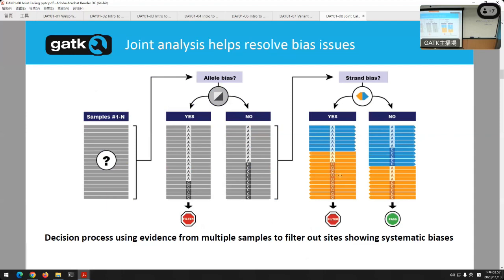You look at that and say, regardless of the number, I can see that now. I can say if they're only showing up one way, that's an artifact of when we're just reading that direction. That's strand bias. But even if you have the same number of A's and C's over a large enough population, you can see that actually it's showing up forward, it's showing up backwards. Statistically, we're seeing it on both strands as we should.